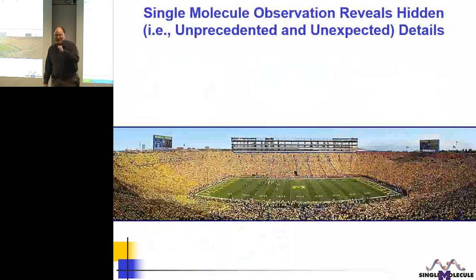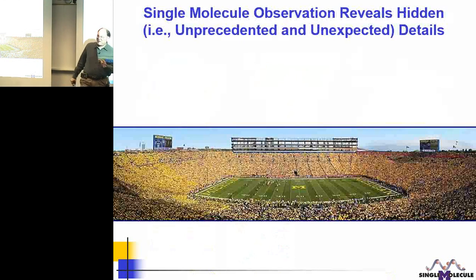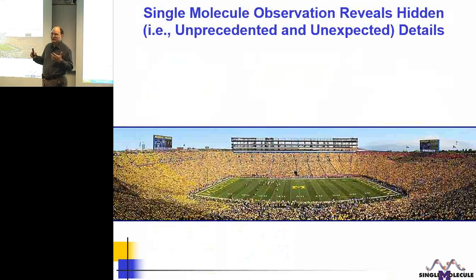Okay, so then the other question that I wanted to ask, basically rhetorically, is why single molecule observation? What advantage does this have over a standard confocal microscopy that you might do in a microscopy imaging laboratory, where you just look at a large number of fluorophores at the same time and average over them?